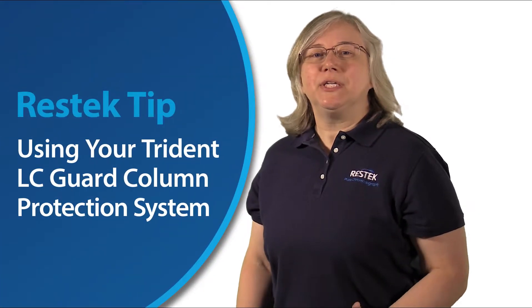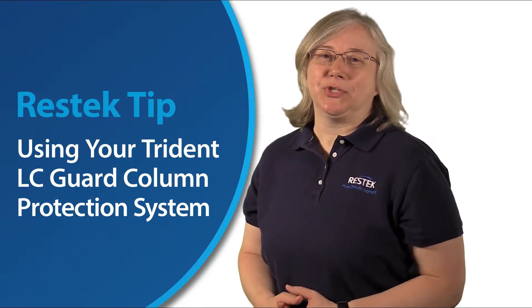Hi everyone, thanks for joining us for this ResTech tip. Our topic today is the Trident Column Protection System.